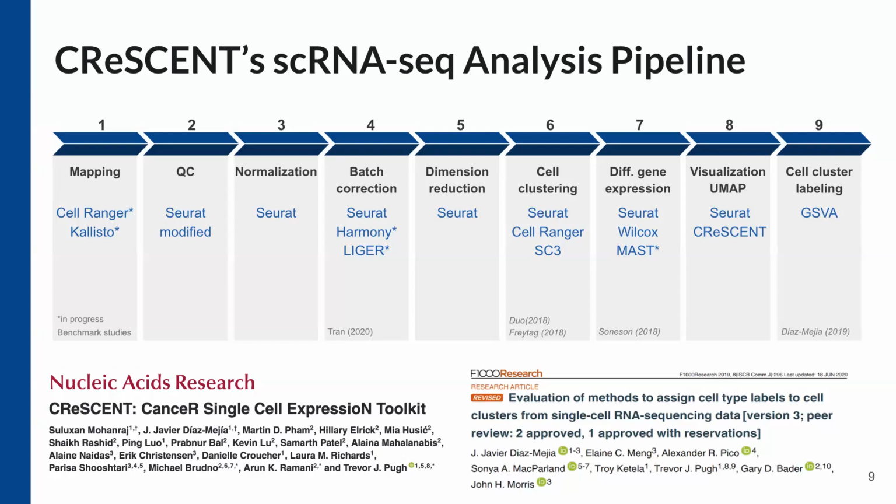The difference between RNA-seq mapping and single-cell RNA-seq mapping is that you need to have splice-aware mapping as well as barcode-aware. So it's a slightly different process than RNA-seq mapping, but there are really well-maintained and sophisticated tools for these things. Crescent doesn't handle that because FASTQ files are quite large. Handling that over a web app is not ideal.